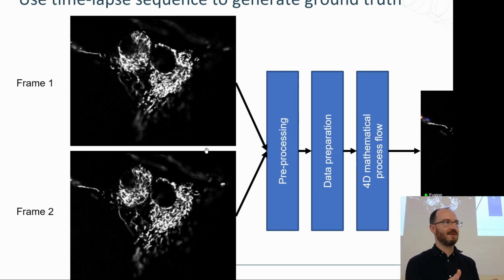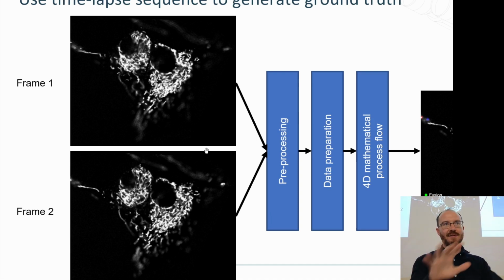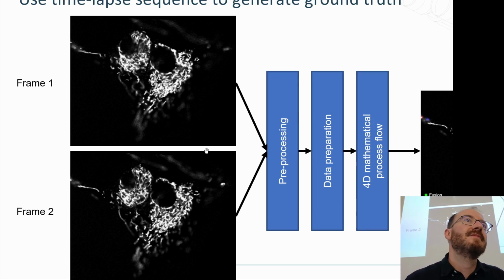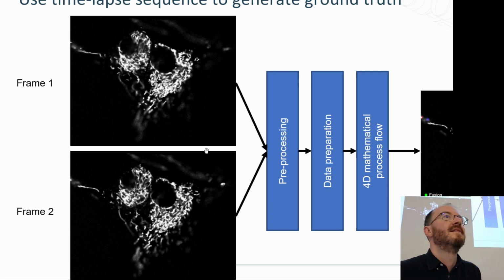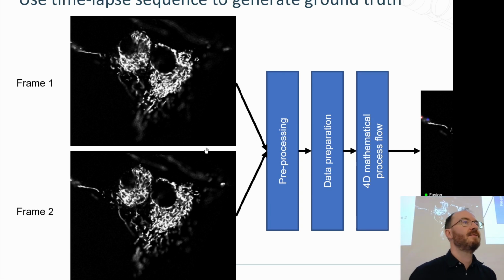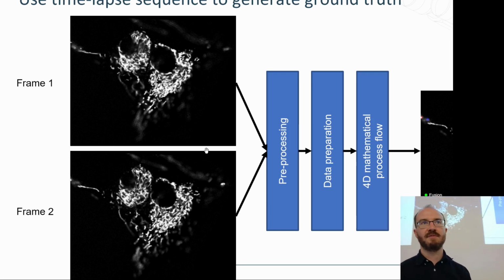So I can mostly do this with just looking back and forth between the frames, primarily relying on, let's call it percentage overlap, because there will be some jitter in the mitochondrial network, so you can't just exactly find overlap. In terms of 2 becoming 1, yes. How do we know if it's a fusing situation? Would the intensity double? No, usually when fusion happens, there is no real observable change in intensity.